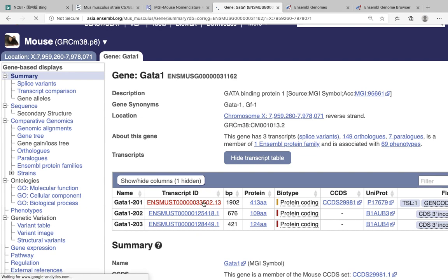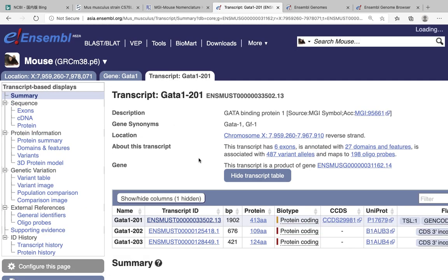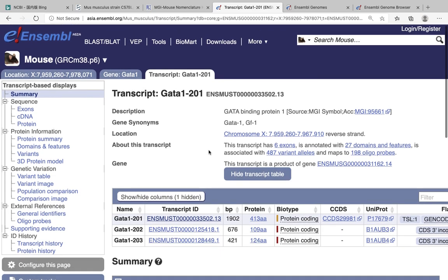Let me click on this one. Yes, and after clicking on this one I will go here to see exons.